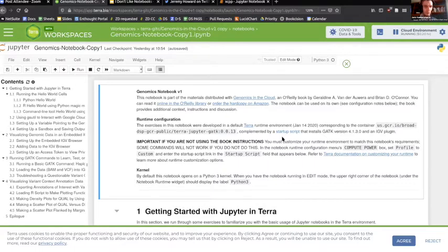So we know how to do all of this stuff, but the notebook provides a convenient way of pulling it all together, doing everything from one and the same environment. And it also allows you to immediately interact with interactive compute. So if you run GITC and you have your variant calls and you want to do some data analysis on that, that's only an R or an import Python, import pandas or whatever away.